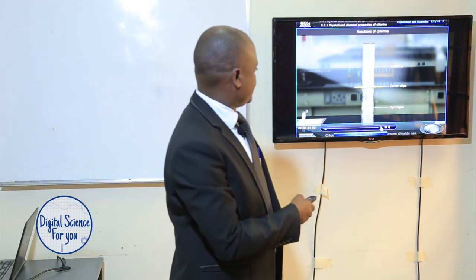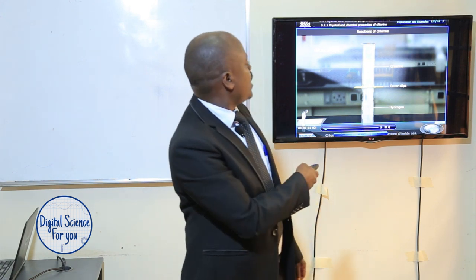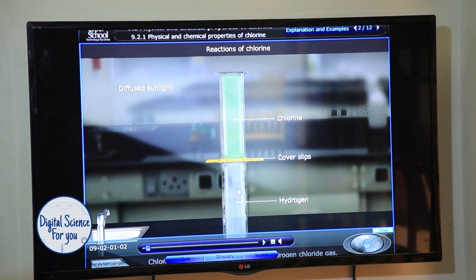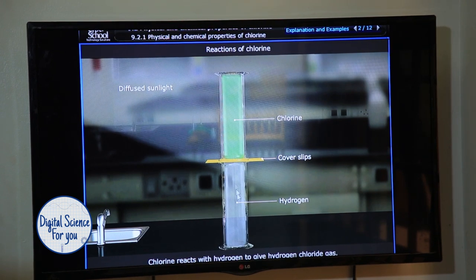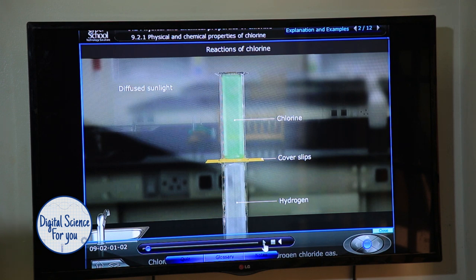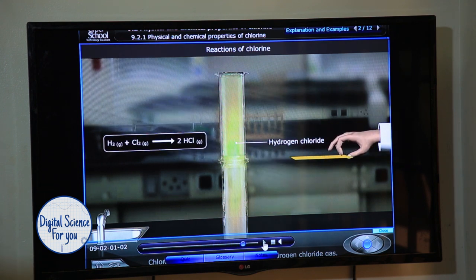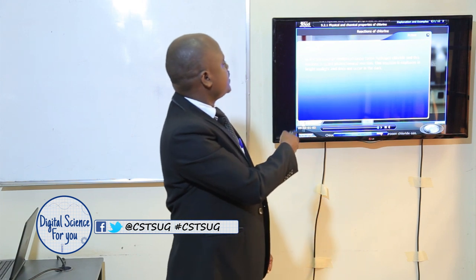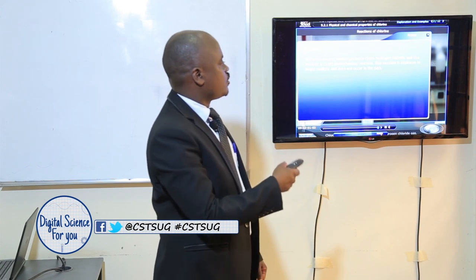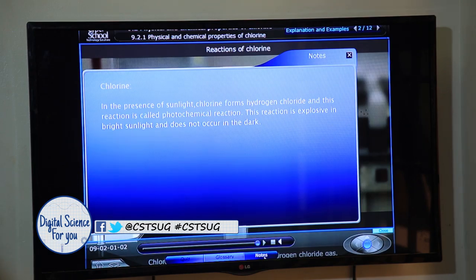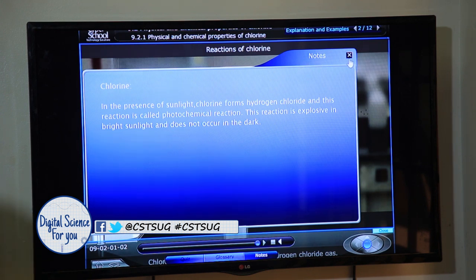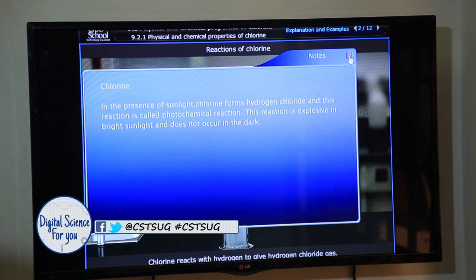Chemical property one: reaction with hydrogen. Here we have two gas jars — the upper one has chlorine, you can see it is green, and the lower one has hydrogen. The two gases are separated using a cover slip. When the cover slip is removed and the setup is exposed to sunlight, the two gases react together and produce hydrogen chloride gas. As stated in your textbooks, in the presence of sunlight, chlorine forms hydrogen chloride gas. This reaction is called a photochemical reaction — just like photosynthesis, photochemical means it takes place in the presence of sunlight. This reaction is very explosive in sunlight but does not occur in the dark.